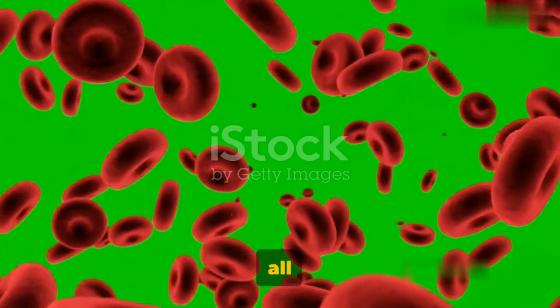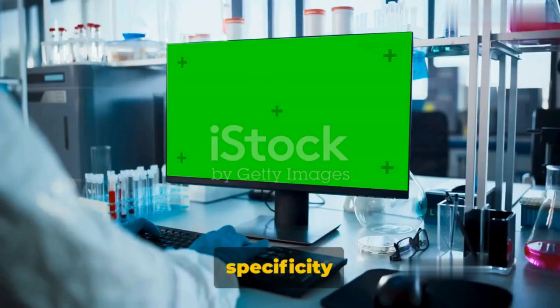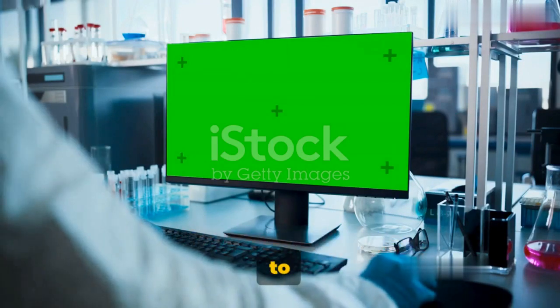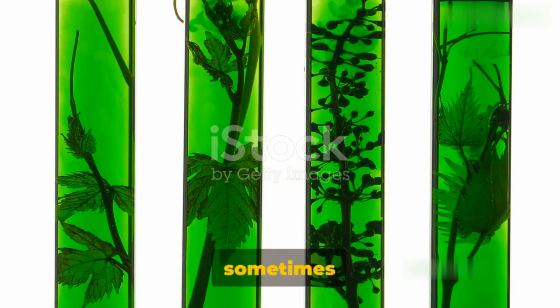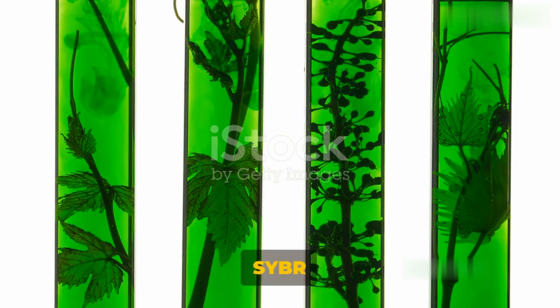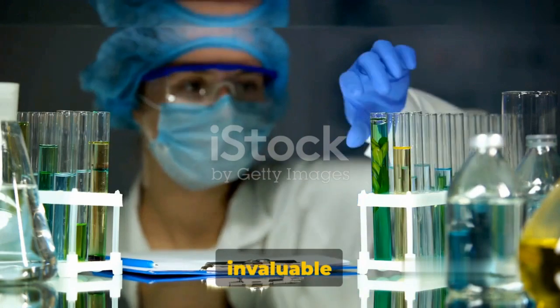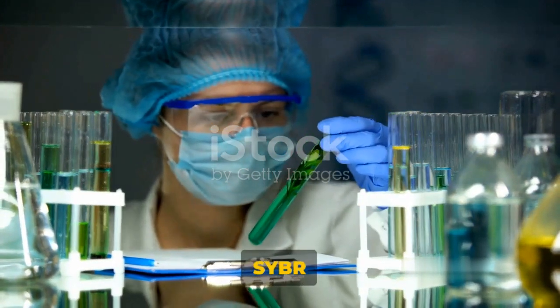However, it's not all roses with SYBR Green. Its main drawback is its lack of specificity as compared to the TaqMan probe. While it binds to the DNA, it does so non-specifically, which can sometimes lead to less precise results. Despite this, SYBR Green is a powerful tool in real-time PCR, a tool that, when used wisely, can provide invaluable insights into the world of DNA. That was all about SYBR Green.